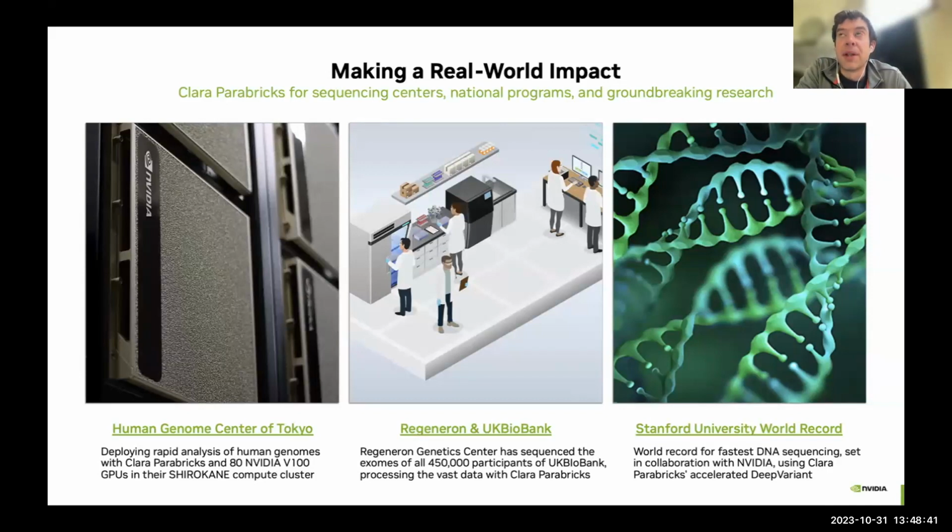This was cool. I don't interact with a lot of clinical work, but this is a really cool story where there was an infant that had some sort of disease, and obviously it's hard to talk to the infant and figure out what's wrong, so they decided that genotyping and figuring out what the disease was was their best option. They used an Oxford Nanopore sequencer, and they used Parabricks for the actual alignment and variant calling.